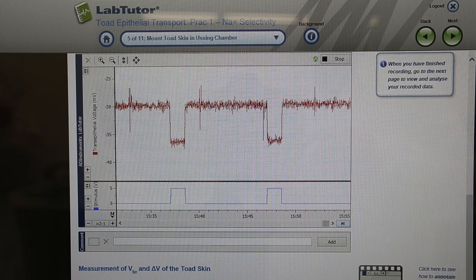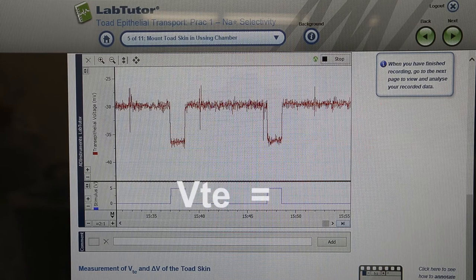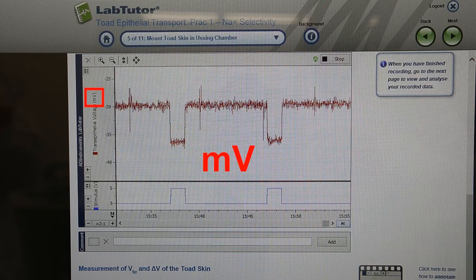Use your cursor to obtain values for the baseline, which we will call V1. Next, obtain the value at the bottom of the peak, which we will call V2. If you subtract V2 from V1, you will obtain delta V. You will use delta V to calculate the transepithelial resistance. In contrast, VTE, which is the baseline potential, can be obtained by subtracting the voltage offset, which we obtained previously, from V1, which is obtained here. Remember that these potentials are in millivolts, as shown in the y-axis of channel 1.